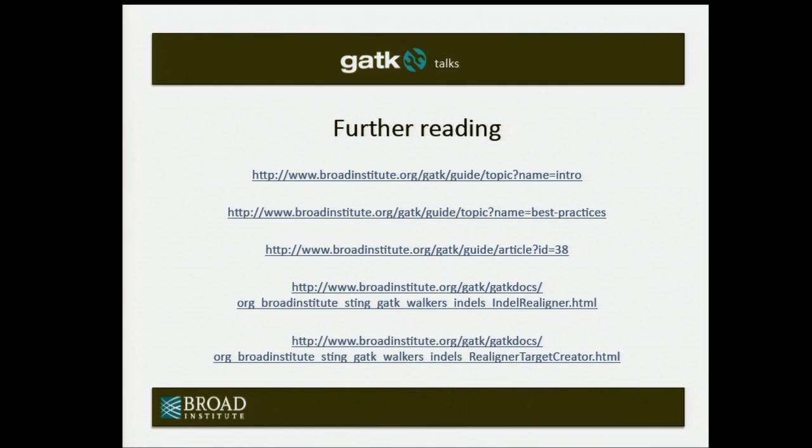Oh, mark duplicates again. It's a great question. Mauricio mentioned that the cigar strings need to be identical for you to be able to mark them as duplicates. And based on the quirks or whims of BWA, you might have the same exact read that got aligned differently. So in the official Broad processing pipeline, they do mark duplicates again. They do it twice. In our processing pipeline, the marginal difference in the calls at that point is so small, it's probably not worth the processing time. But the Broad has a system set up in Picard where everything is fast and automated, and they do it again. But for normal people, no, we don't really need to mark again. But it's a great question.